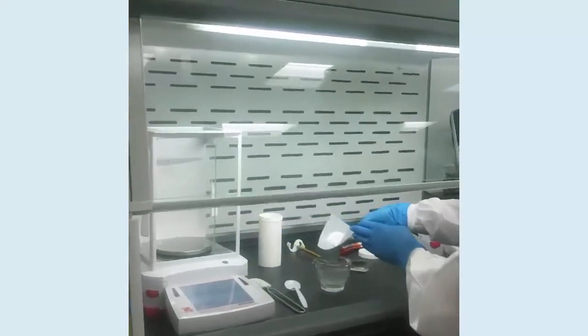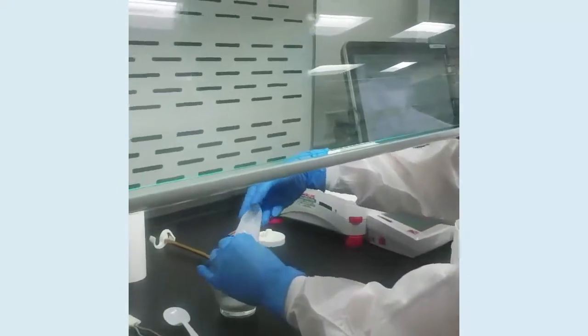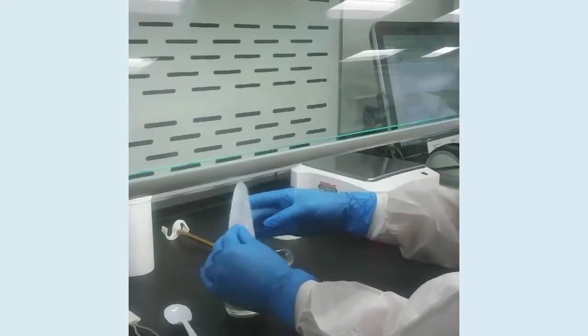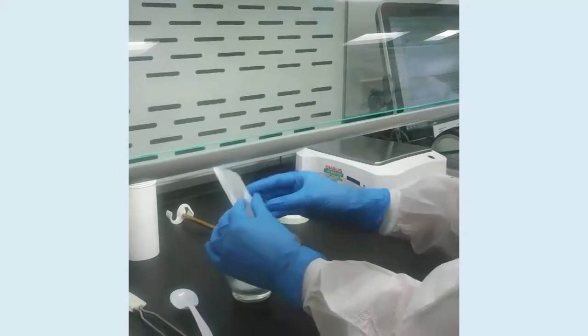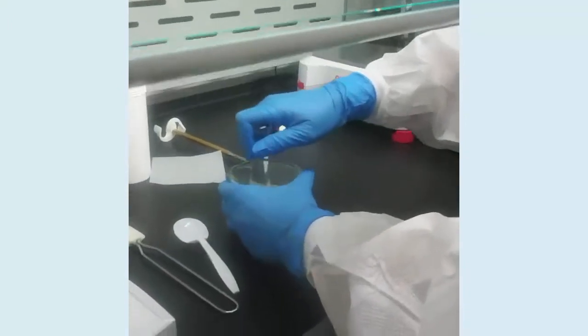I've weighed out the powder that's required for the prescription in hand. I'm going to use weigh paper to make sure I get all the powder that I need, and then I'm just going to triturate this to break it down into a smaller particle size.